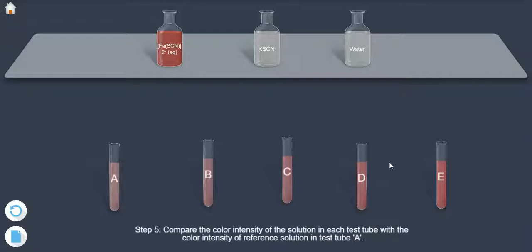Step 5. Compare the colour intensity of the solution in each test tube with the colour intensity of reference solution in test tube A.